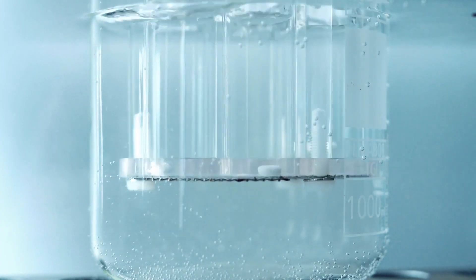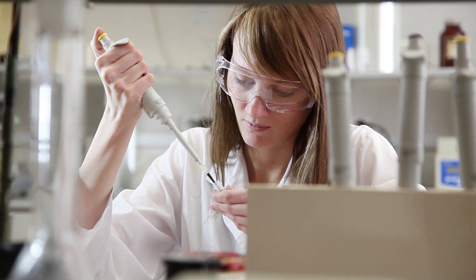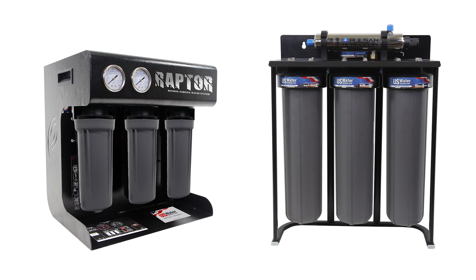Labs and their water needs vary greatly, but many labs and other applications where ultra-pure water is needed can be best served with our new Raptor Lab Water System. The Raptor is a game changer because it is not expensive, it's compact, it's powerful, and simple to operate as well as maintain. We offer the Raptor in two models: up to 70 liters per hour or up to 118 liters per hour.